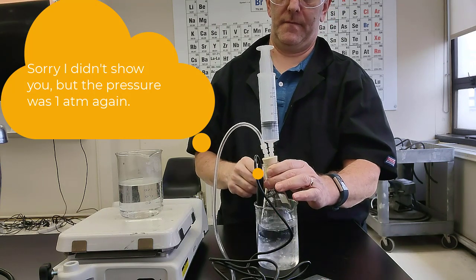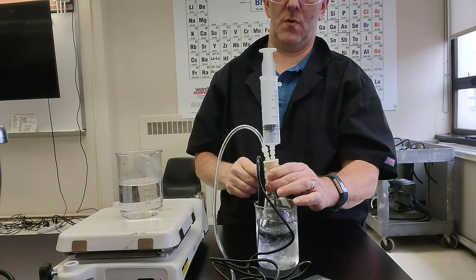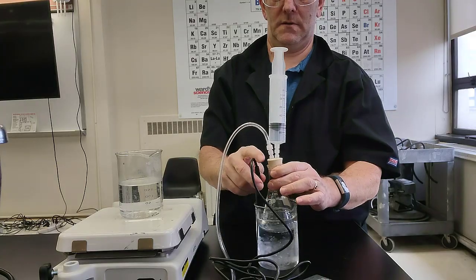Okay. So colder, the volume seems to have shrunk. Hotter, the volume seems to have increased.